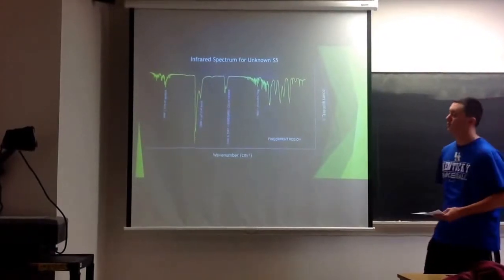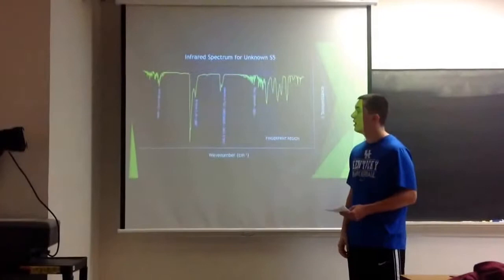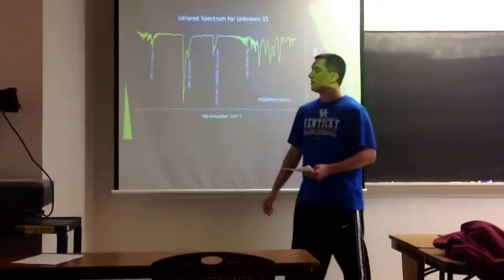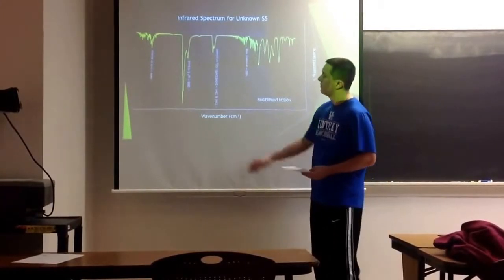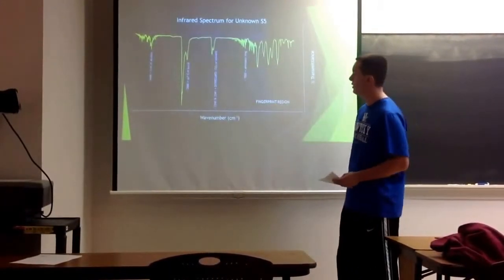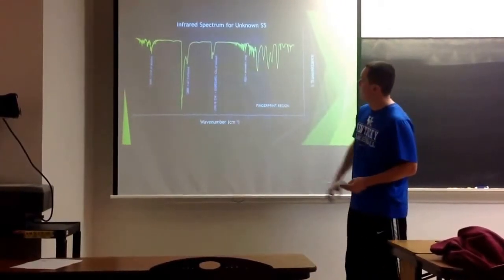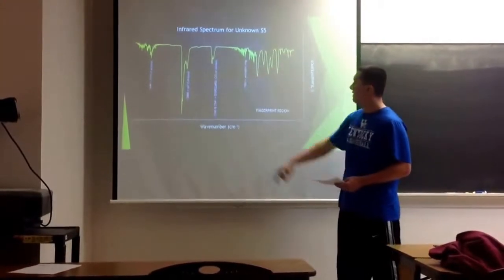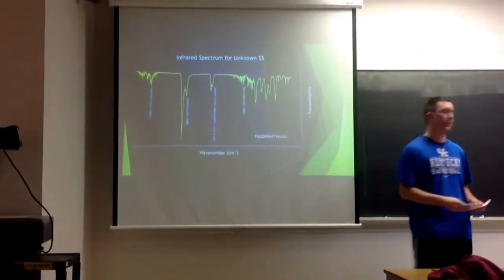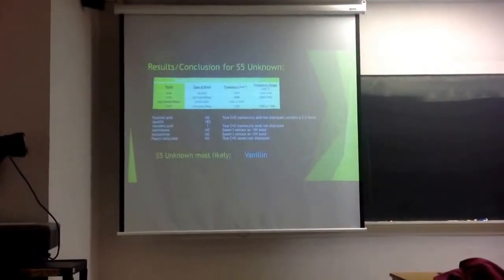Lastly, our last spectrum was for S5. That's our solid we analyzed using the ATR-IR spec. There's definitely an alcohol group present around 3648. Right here, there's the sp3 CH that we could deduce. Of course, we're going to disregard our CO2 again. And right around 1500 here, it looks like we could have an aromatic ring. So, of course, I think all the molecules do have an aromatic ring, so that should be present.